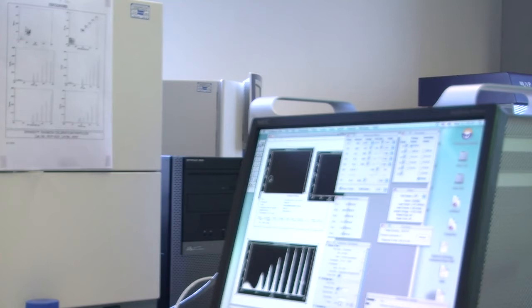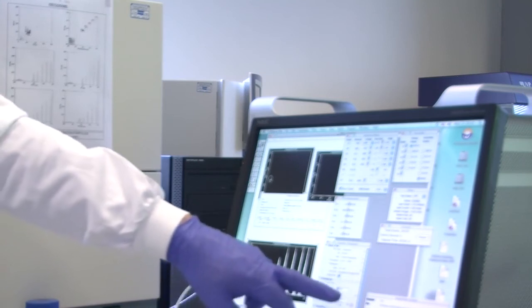So that's why we are using our control cell lines. We're using the biological control, the one that has our markers, and the cell line that doesn't have our markers. They effectively form our standards. Because if our test cell line, the one we're interested in looking at, has as much as our positive control, it's got quite a lot of it. If it has only slightly more than the negative control, it's barely expressing it, but there's a tiny bit there, and so on.